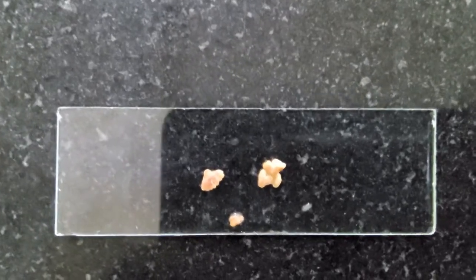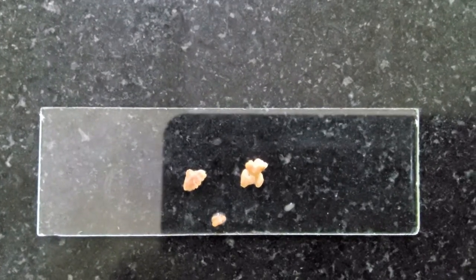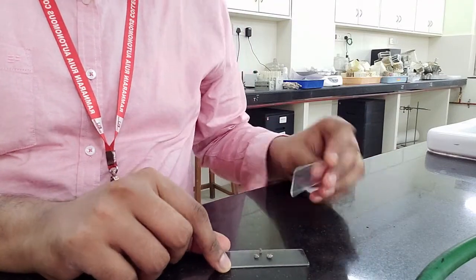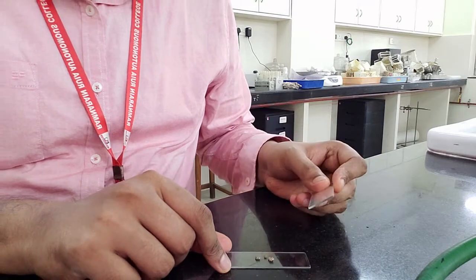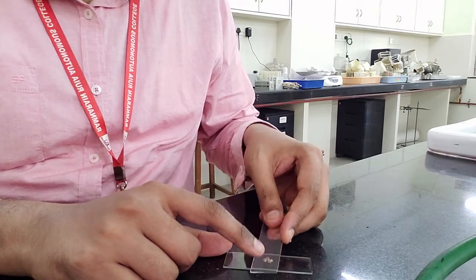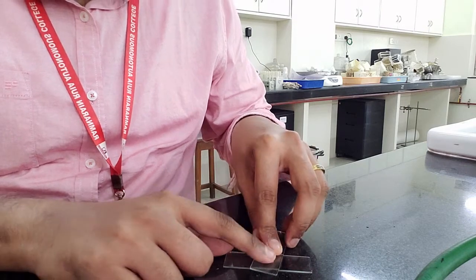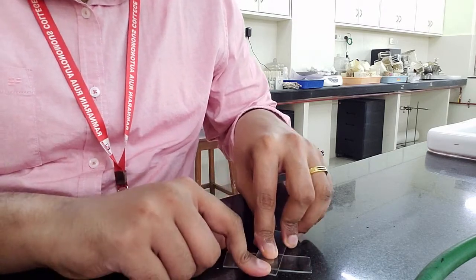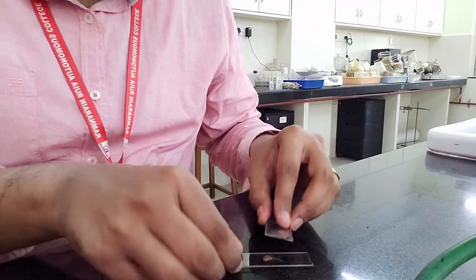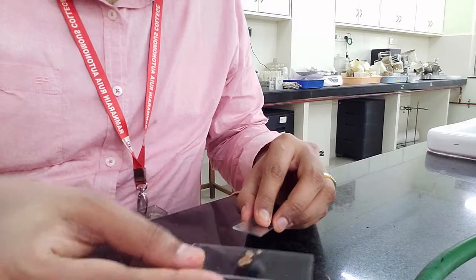These are the root nodules after several rounds of washing. We are going to crush them between two slides — both slides are alcohol-sterilized to reduce contamination as far as possible. I have placed these root nodules on a drop of sterile distilled water and am going to crush them between the slides with very gentle pressure so that the exudate comes out onto the slide. That exudate can be stained and also used for plating on the crema agar.